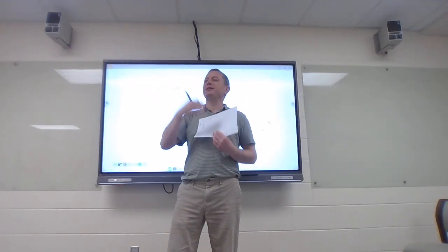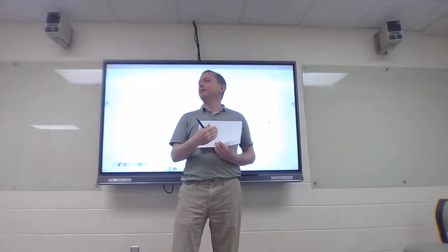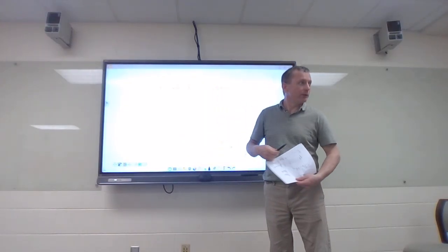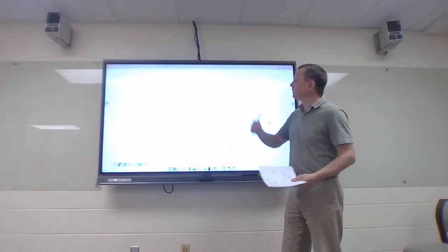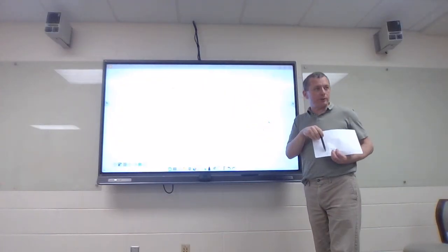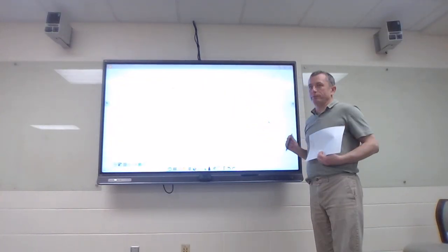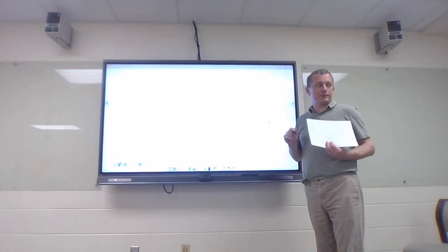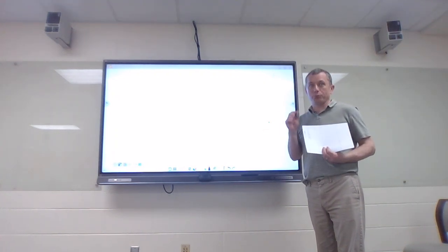Most of the time, when you see something at 7, think aromatic ring. We could have looked at the IR, saw the weak CH, or looked at the molecular formula and said, ooh, aromatic. But boy, oh boy, look here. If I see that, draw me a benzene ring. Okay?